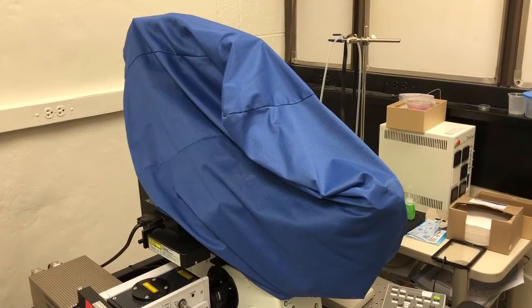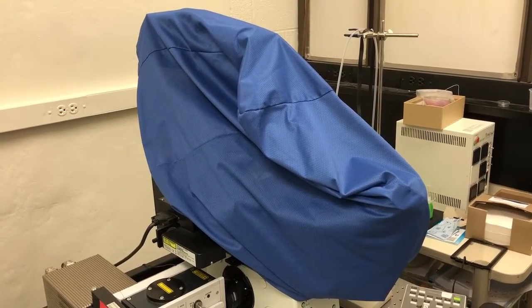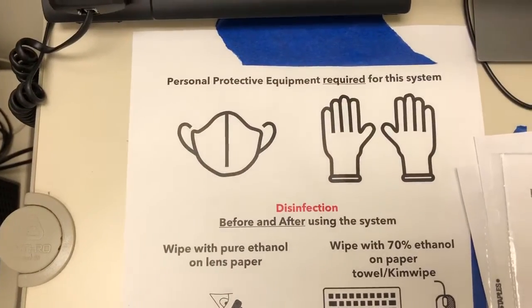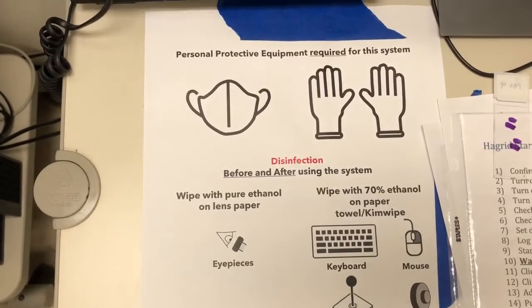This video will show you how to operate Hagrid, our spinning disk microscope. Before we start anything else, we need to make sure we have the proper personal protective equipment required for the system and that we disinfect the system before using it. For this system we require a mask and gloves, and you can see I'm properly equipped to use it.